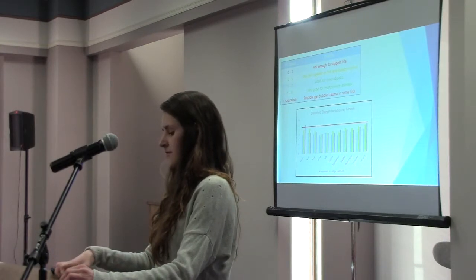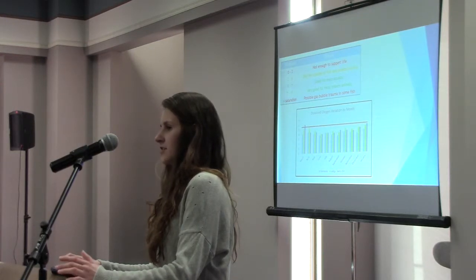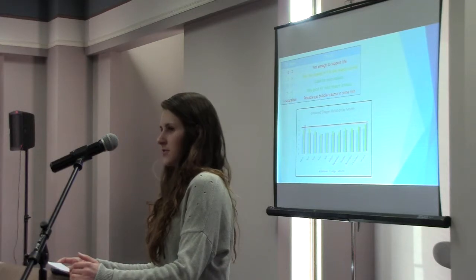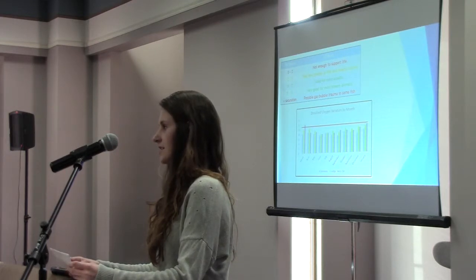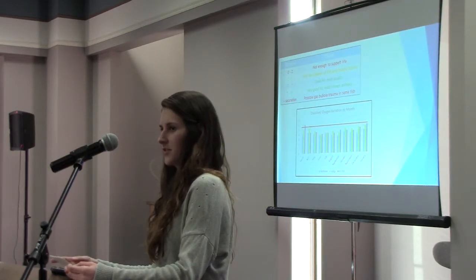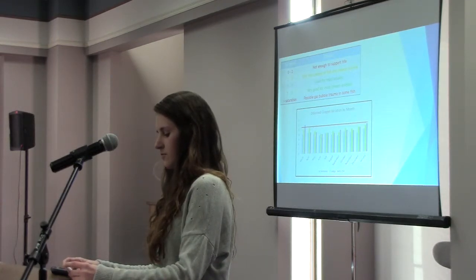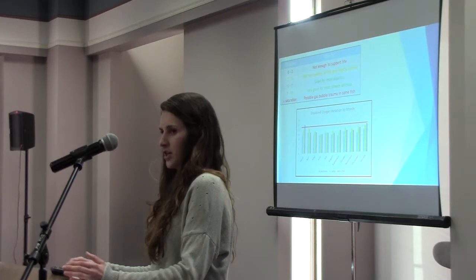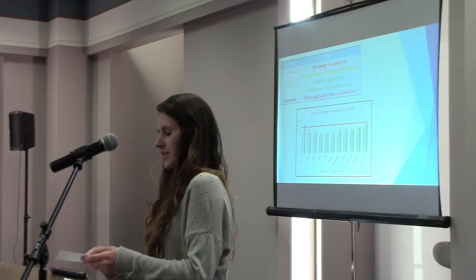Next is the dissolved oxygen. Dissolved oxygen is vital for the existence of aquatic life. If the amount is too high or too low, it can be fatal to the aquatic life within the stream. Oxygen enters a water body when the air is mixed with the water, or when aquatic plants release oxygen through photosynthesis. The test showed the parts per million of oxygen dissolved in water, and the preferred range is 5 to 11 parts per million. Our three locations were acceptable to perfect, aside from the 204 location in March, which had a dissolved oxygen level of 12 parts per million.